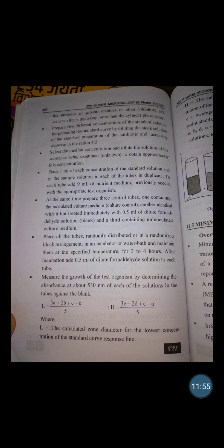Where L is the calculated zone diameter for the lowest concentration of the standard curve response line, and H is the calculated zone diameter for the highest concentration of the standard curve response line.